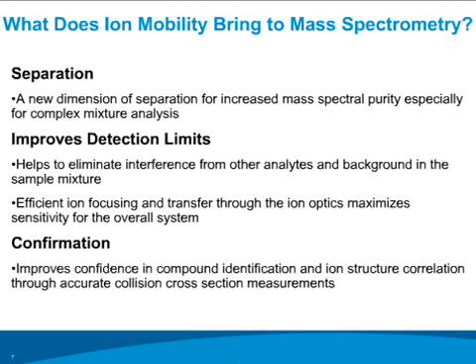As we all know, over the years, as chromatographic separation has gotten better, that's improved our ability to look into complex samples and detect and determine the structure of more and more components in that mixture. I think what you'll see today is that mobility separation pushes the power of mass spectrometry even further into complex mixtures.